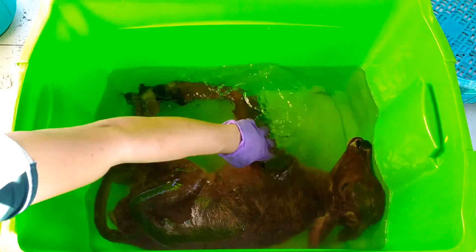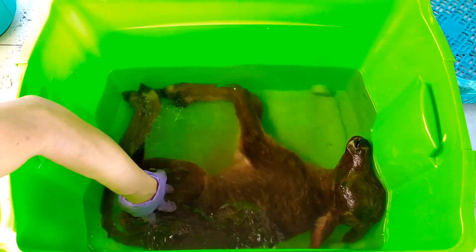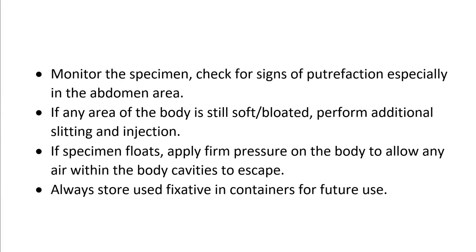Cover the container tight and allow the fixative to work throughout the specimen for a couple of weeks for a large specimen such as this. Monitor the specimen every few days and carefully check for signs of putrefaction especially in the abdomen by gently poking it with the blunt end of a stick or metal rod. If any area is still soft or looks bloated, immediately make additional slits and inject a good quantity of fixative into it. Add more formalin to the container if necessary. If the specimen floats, wear gloves and apply firm pressure on the body to allow air within the body cavities to escape. In this case, fixation progressed really well with no signs of putrefaction even by the end of two weeks. Once fixed, the waste fixative solution can be stored for future fixation of other specimens.